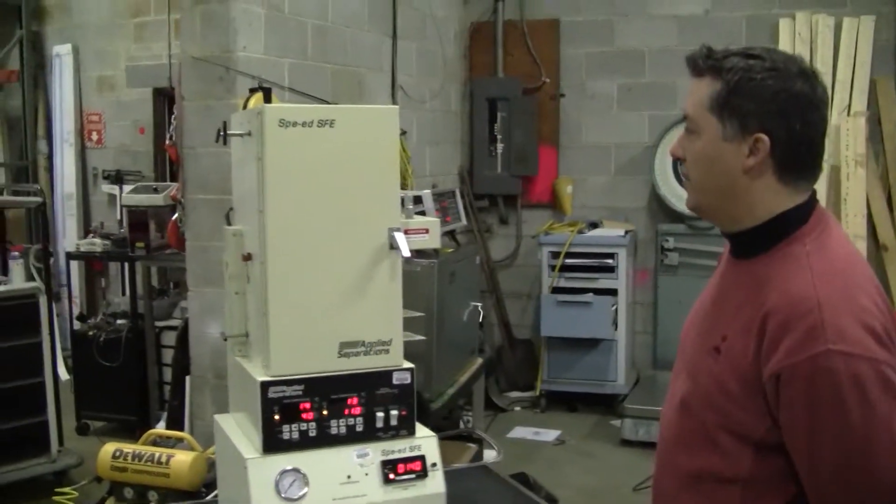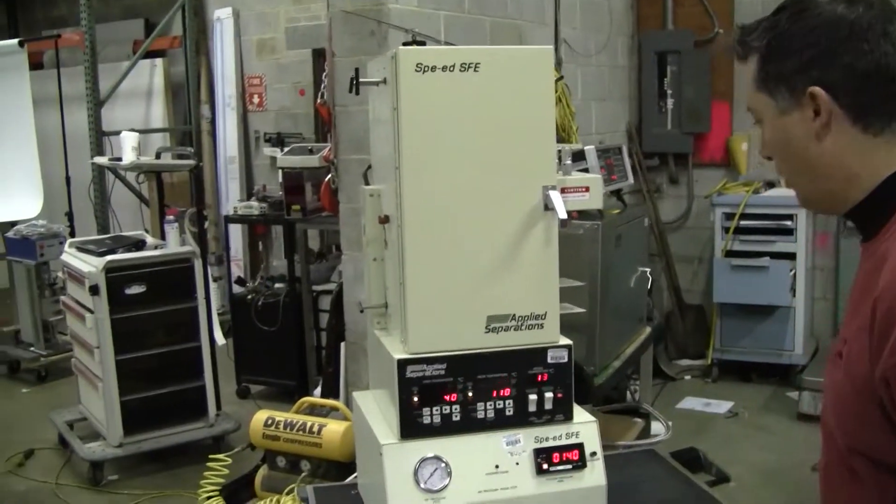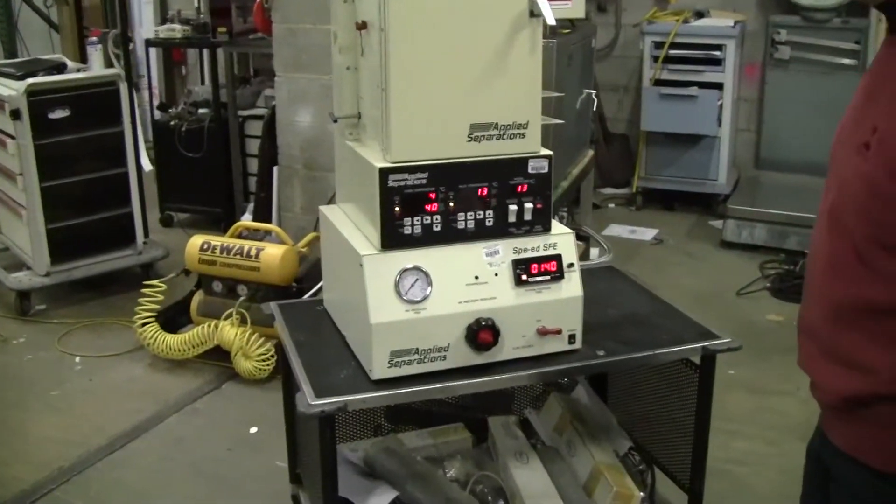Good morning, this is Michael Naitiao from Hi-Tech Trader. This is the Speed Super Critical Extraction Unit by Applied Separations.